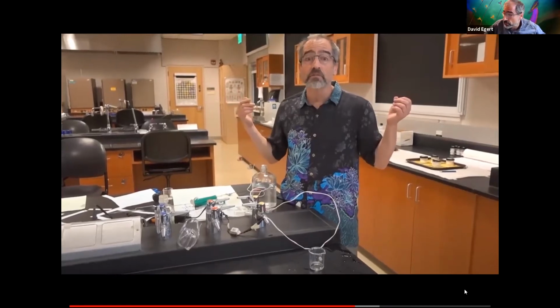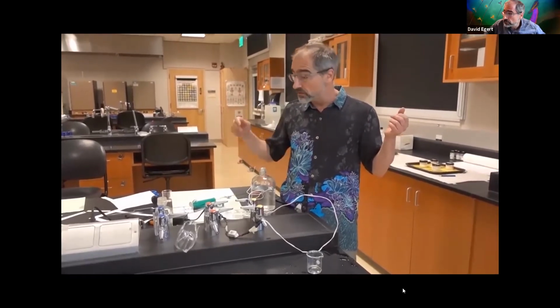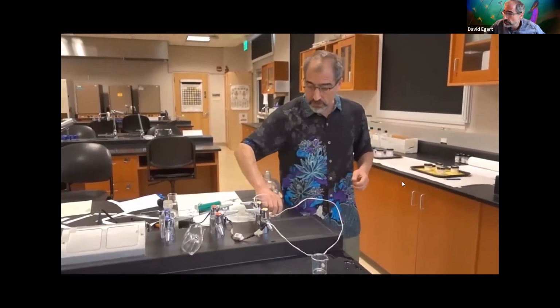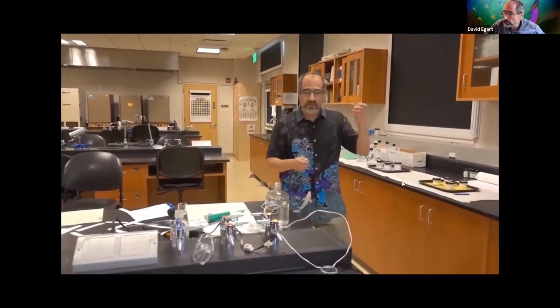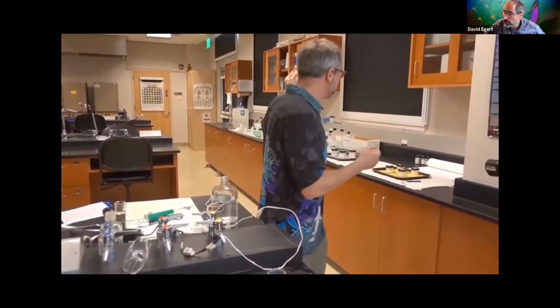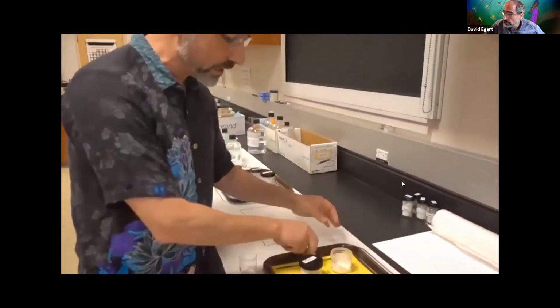Now, instead of dissolving them in water, put them in oil. So let's do that. I'm going to take one of my little beakers. It doesn't matter which electrolyte I pick. I'll pick table salt, the one I'm most familiar with in my life.